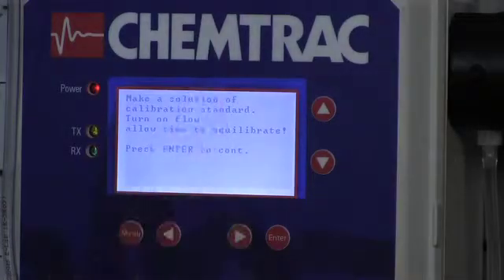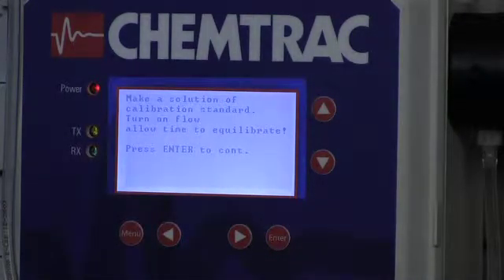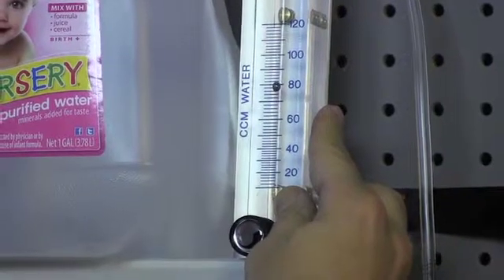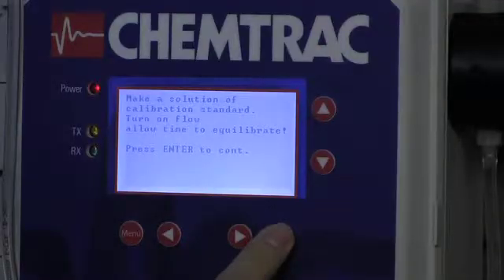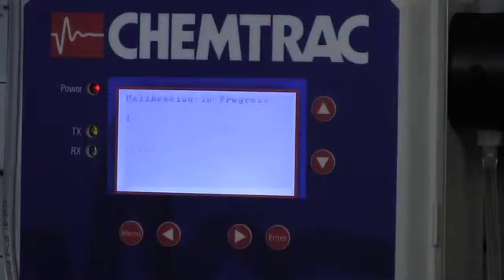Now we want to make sure that our flow is properly set. The flow being at 75 milliliters per minute is very important when you're doing this calibration. So we'll get it set right where we want it, and then we're going to hit enter to continue. It'll take just about 15 seconds or so to perform the calibration.